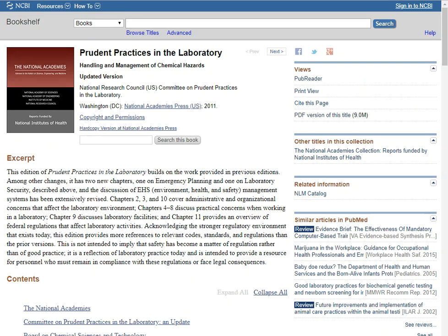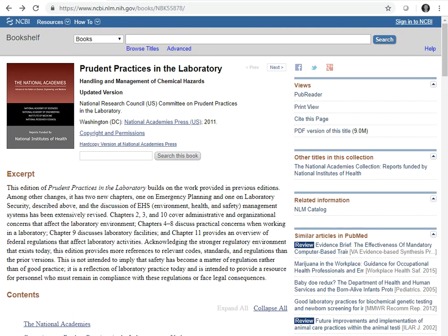Now, if you want an online resource that you can access that has some pretty good information, then up here at the very top, you're going to see the website that you can use to access this link that I have up on the screen right now for Prudent Practices in the Laboratory.